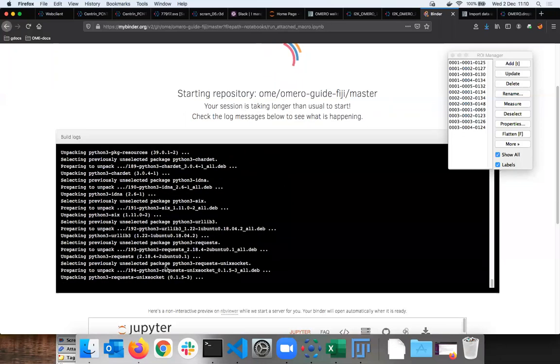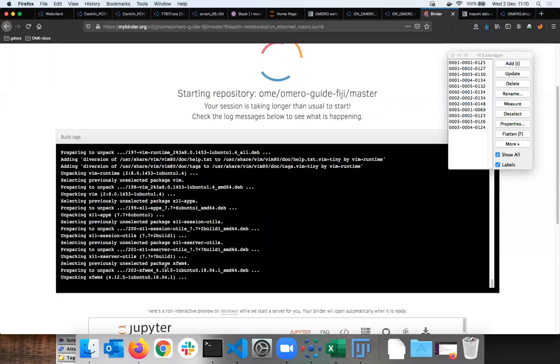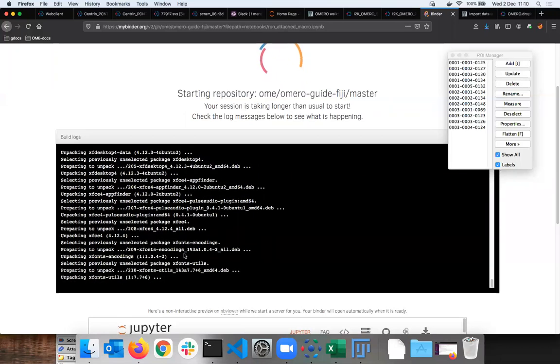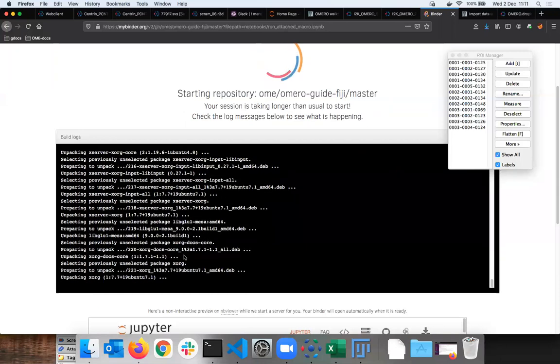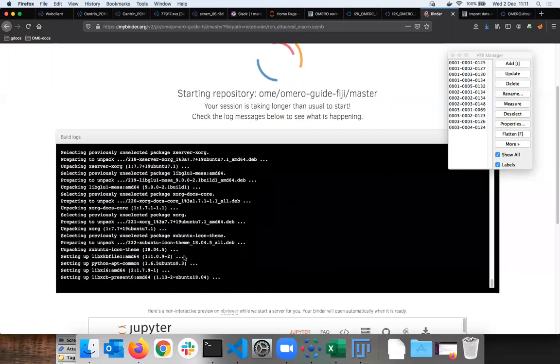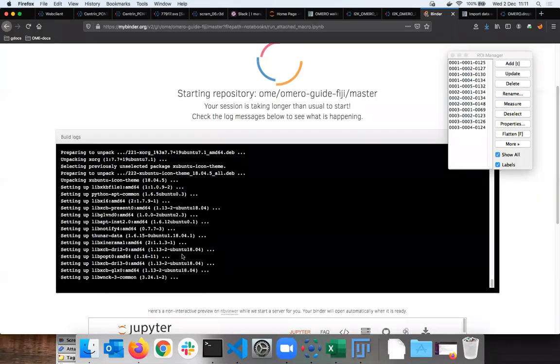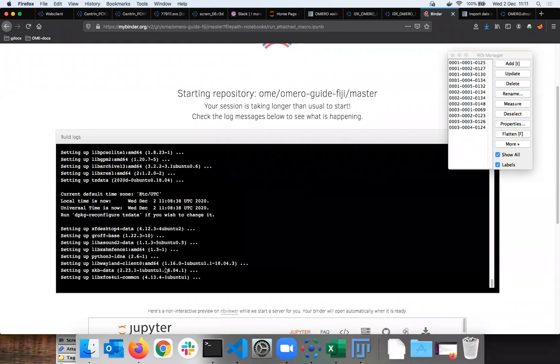Now I can go one step further, which we plan to do in the future, and have the cloud place simply closer to my server, something like having it on the cluster, and have the analysis run close to the data where the data sits, so that the transfer of the data between those 2 places is not so long.